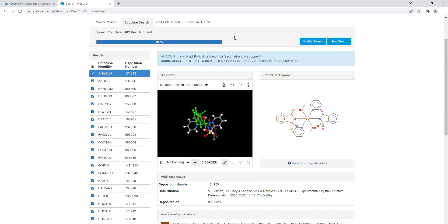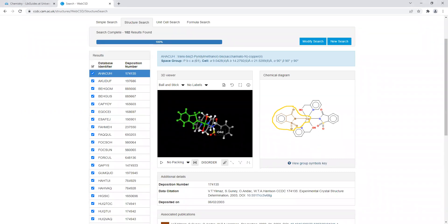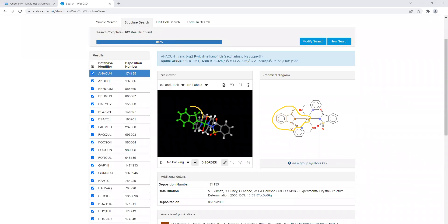If we look here, if you look at the chemical diagram, the part highlighted in brown is your substructure that you've drawn. So this contains a saccharinate and copper. Also in the three-dimensional structure, if I rotate it, the part highlighted in a lime green color is our substructure component.